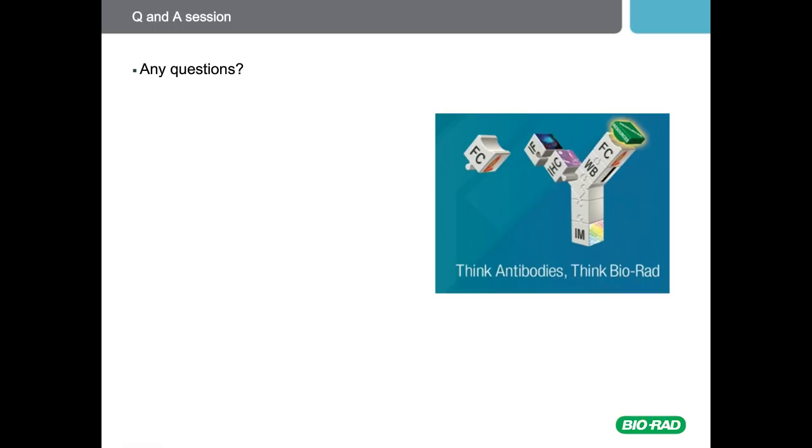What you'll find here is that the dead cells will actually pellet at the bottom, whereas on the interface between the media and the Ficoll, you will find the live cells. You can then remove these carefully and do your standard staining.